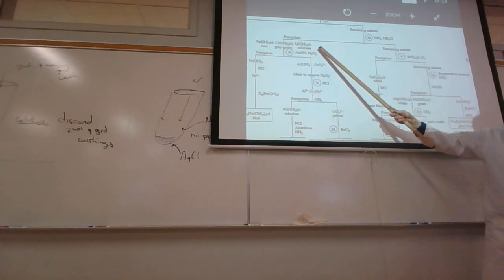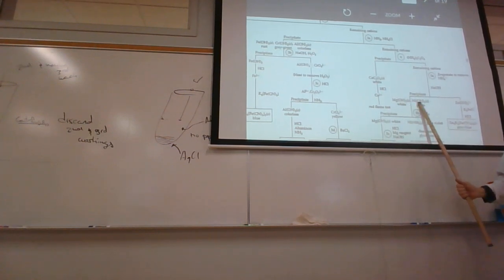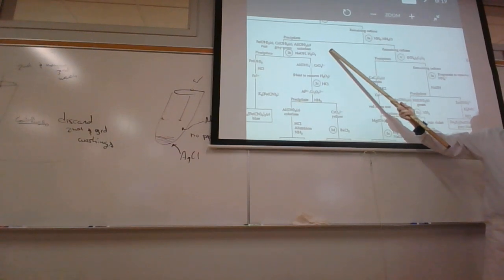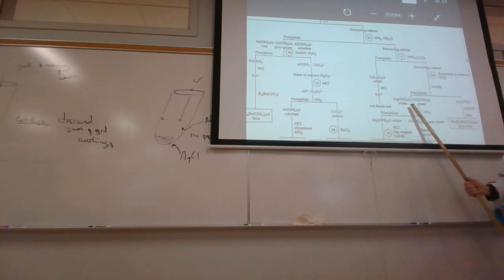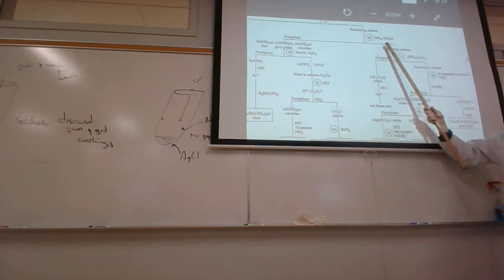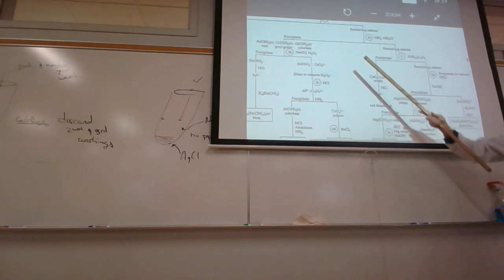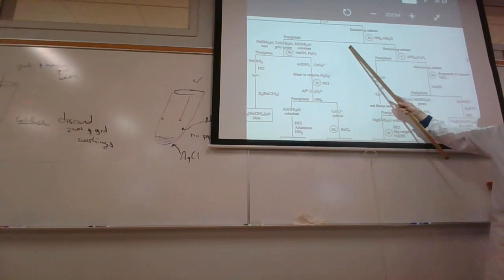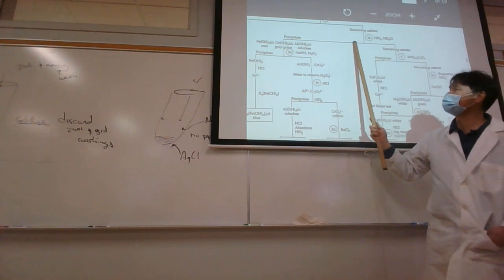So this is just to control how much, in other words, this is a selective precipitation. We're controlling precipitating out the +3 hydroxides versus the +2 hydroxides. We want the +2 hydroxides to stay. Even if we add excess ammonia here, it's not going to be too big of a deal because, well, actually magnesium, if you have way too much ammonia, then you can precipitate out the magnesium. So we might lose the magnesium over here. So we'll just stop here when it turns blue and then maybe add a drop additional, see what happens, or a couple of drops additional.